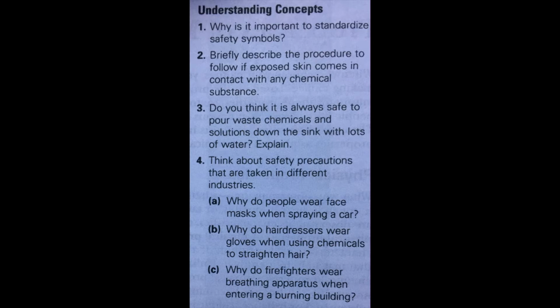The best thing to do is any salts. Salts are water soluble. You wash your hands, wash your arm, however you expose them, and then tell the teacher.